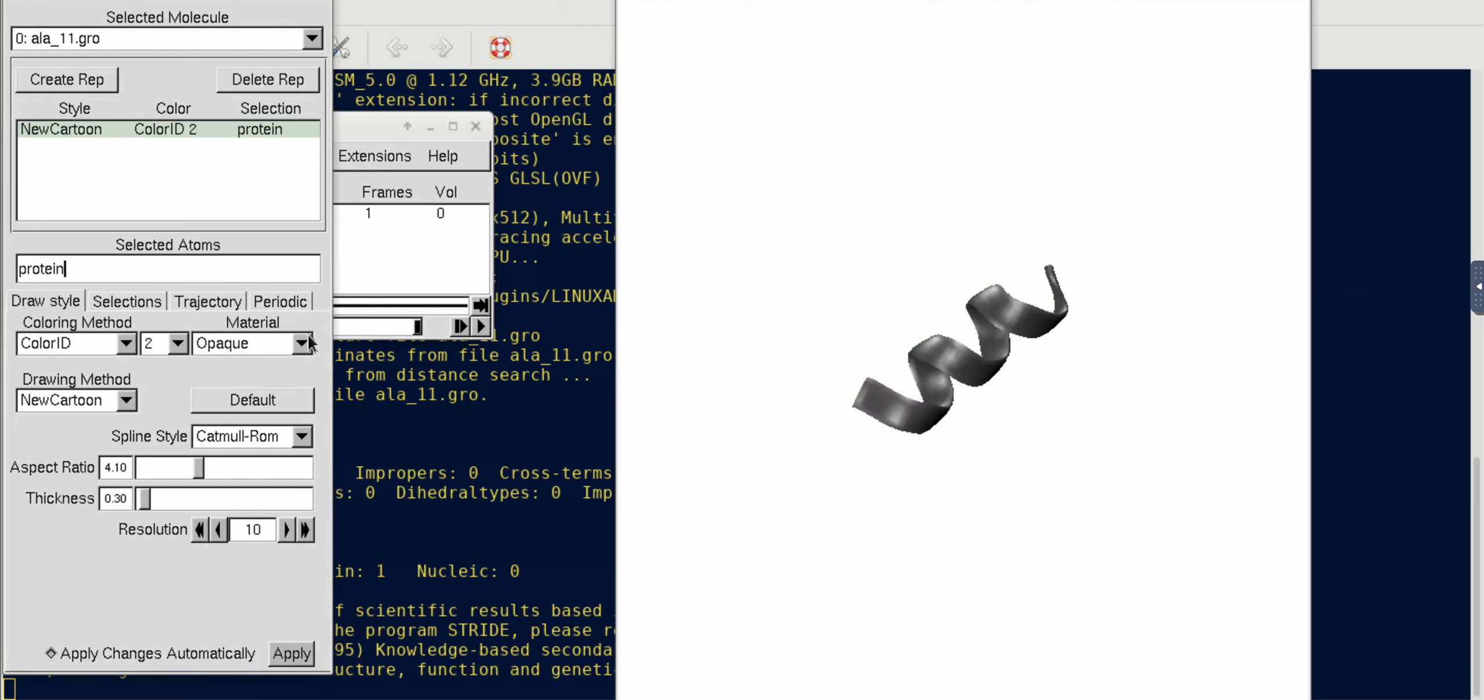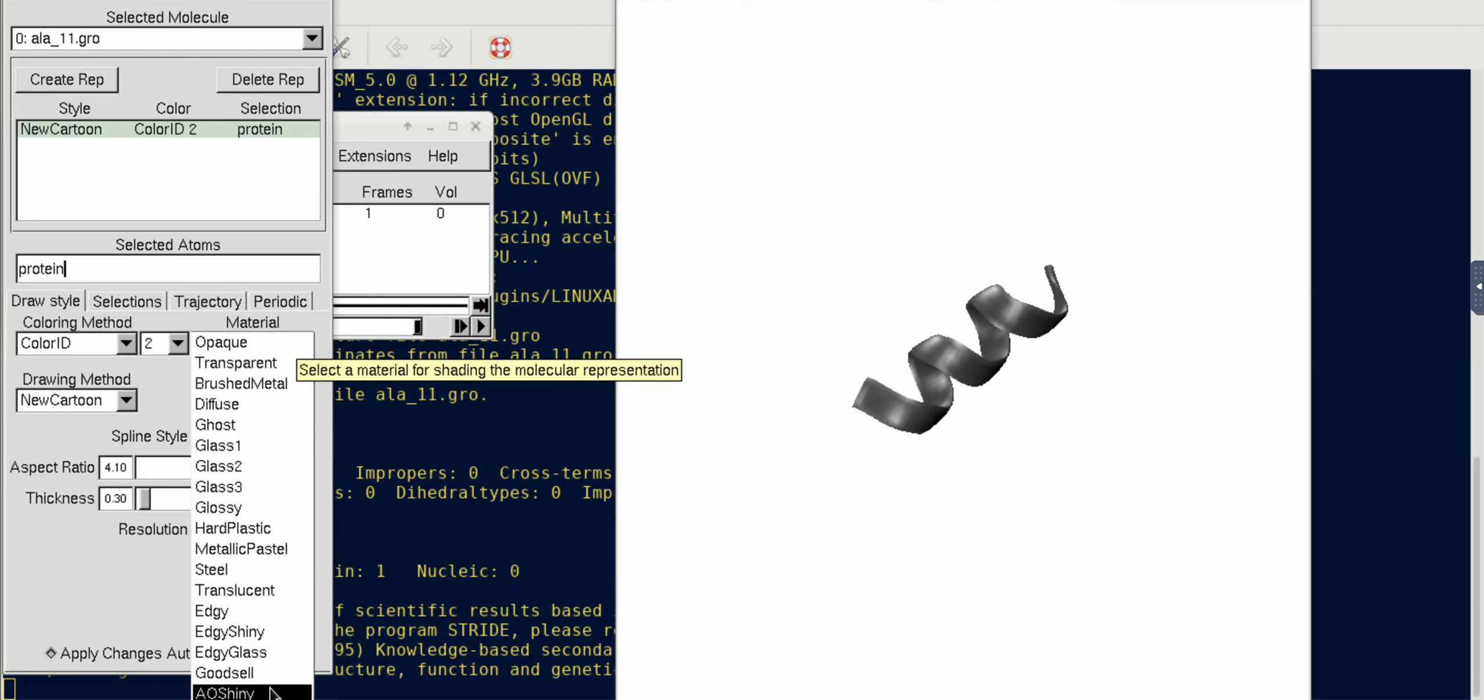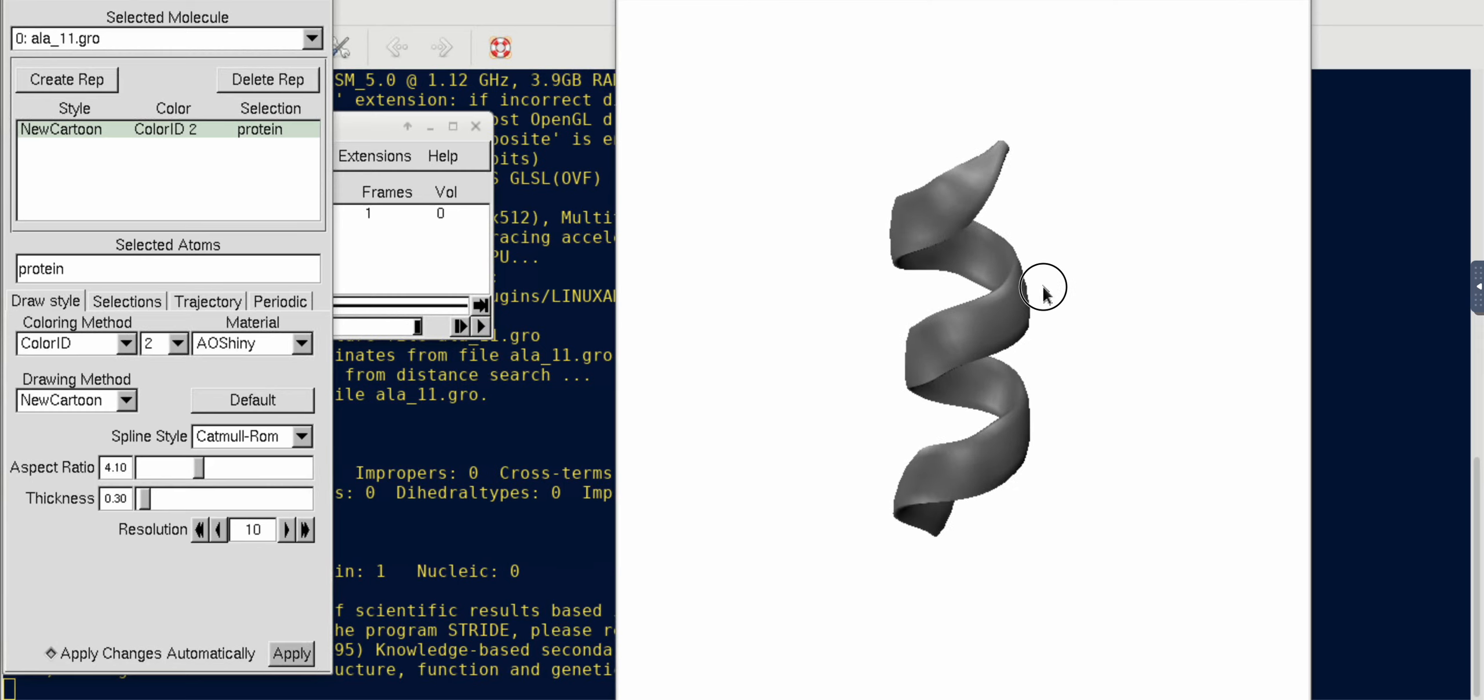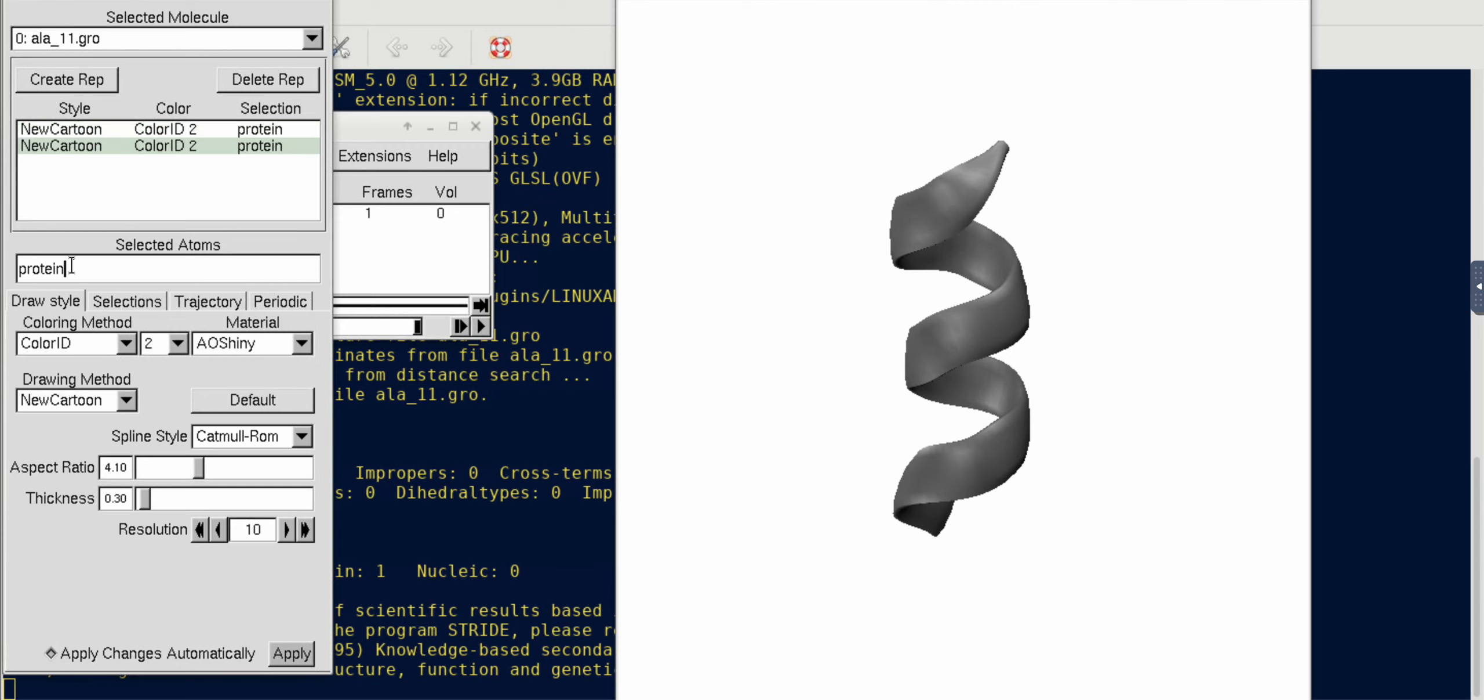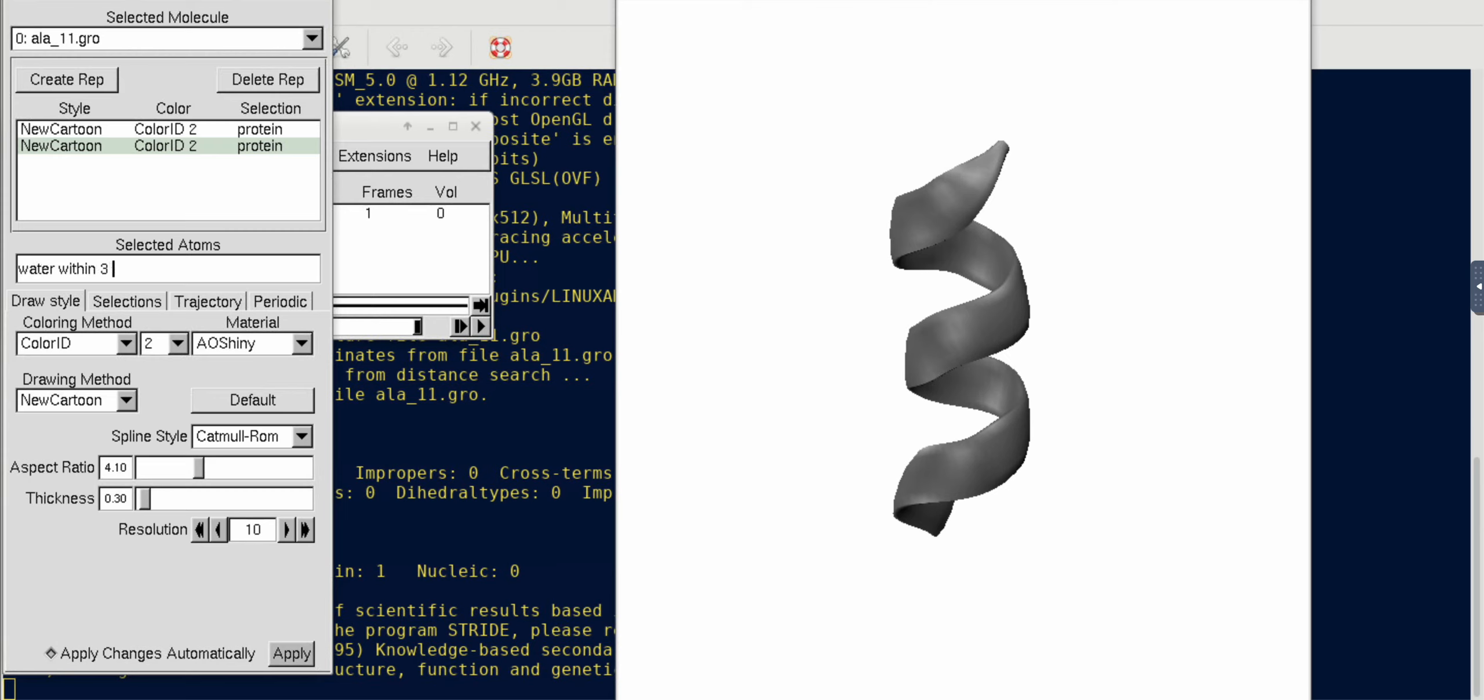Let's change the drawing method to New Cartoon so that the alpha helix becomes a little prominent. Optionally you can change the color, which I would like to make gray. Also if you want, you can change the material representation, which I'm going to do AO Shiny. Sometimes it looks good.